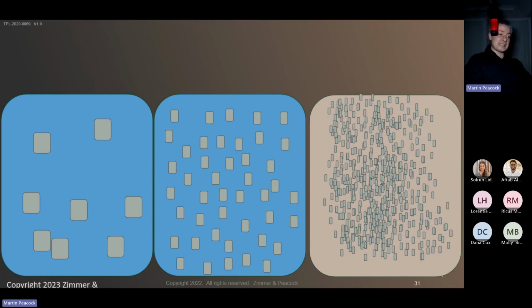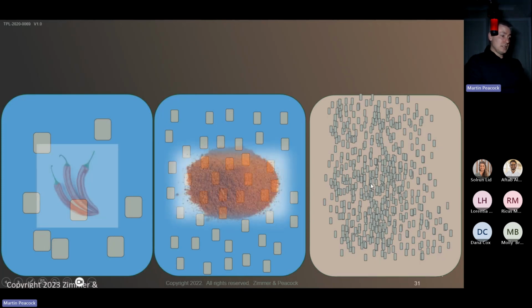You don't have to take as many samples because the capsaicin is fairly evenly distributed. So extremely heterogeneous would be a chili, more homogeneous would be a chili powder, and something that's quite pureed like a sauce is easier to sample because the capsaicin is more evenly distributed throughout.